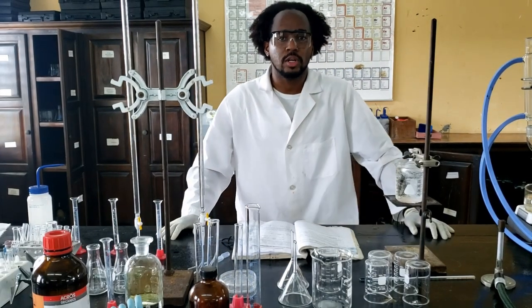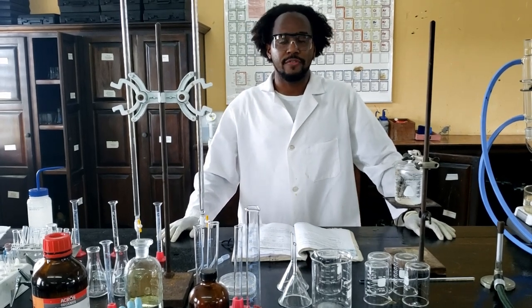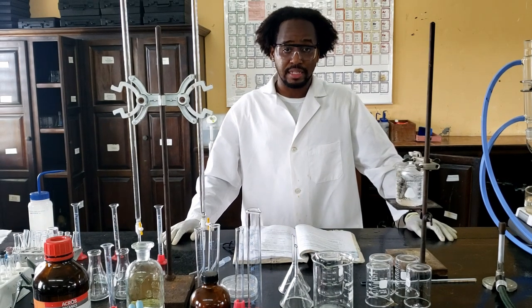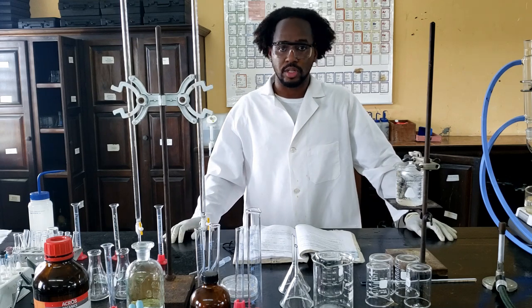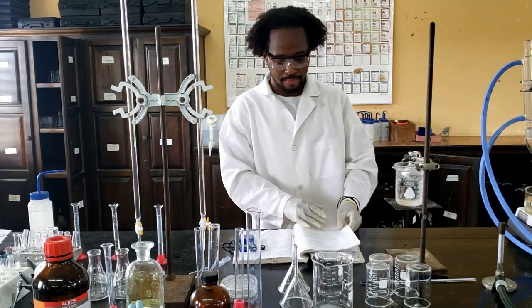Hello again and welcome to another organic chemistry lab. Today we're going to be doing the electrophilic substitution reaction. We're going to be doing the nitration of bromobenzene, and also a thin layer chromatography test with some column chromatography tests as well. So I'll get straight into the lab.